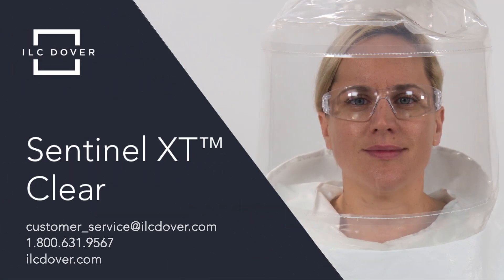The Sentinel XT Clearhood PAPR system from ILC Dover: state-of-the-art protection for the most demanding applications. For more information, contact us today.